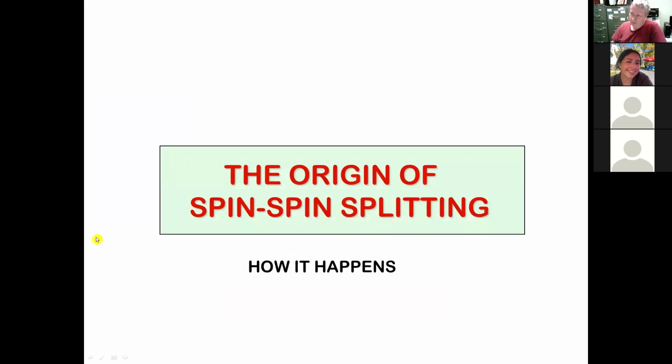Okay, so why does it happen? Why do we have the n+1 rule? Why do we count the neighbors and add 1? This is cool. It's a kind of theoretical discussion. It's not that bad though, and not too critical. You don't have to learn this theory, and I'm not going to test you on the theory, but just follow it as best as you can.